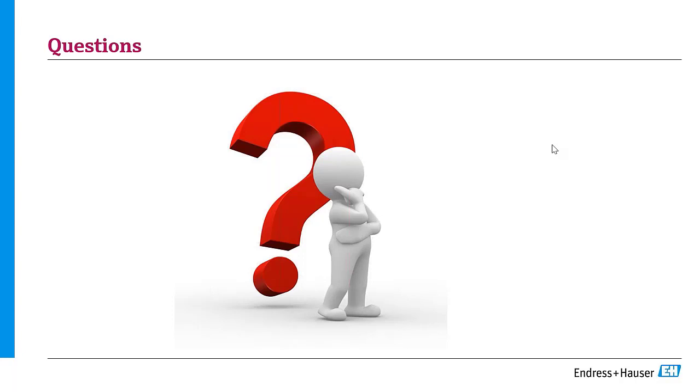So I have another one. Calibration should be conducted by buffers or by a number of samples? When we talk about calibrating turbidity sensors, it's not quite the same as calibrating pH electrodes, and I'm assuming that's where this question is coming from.